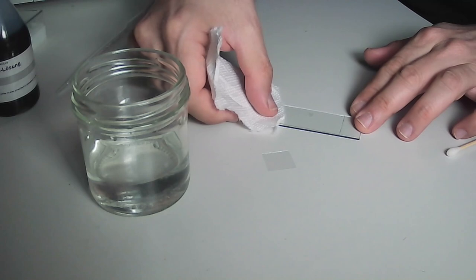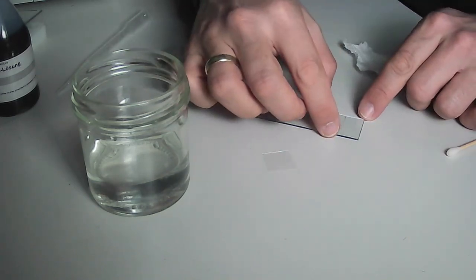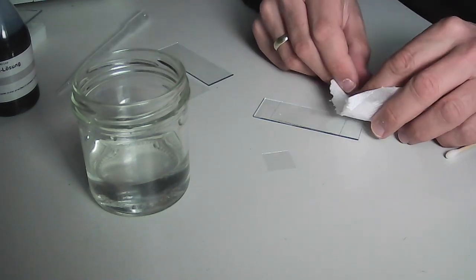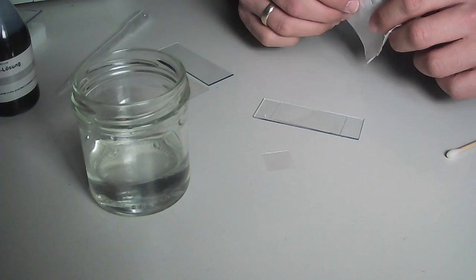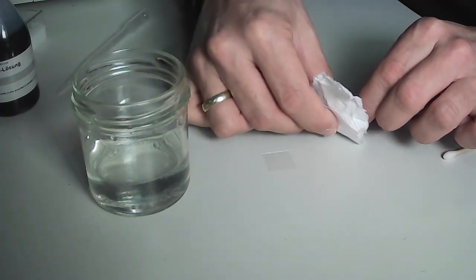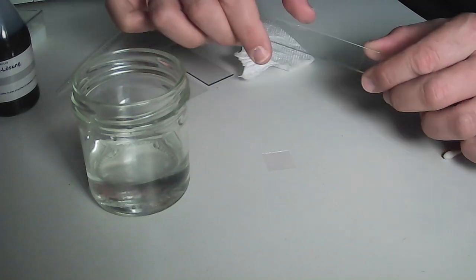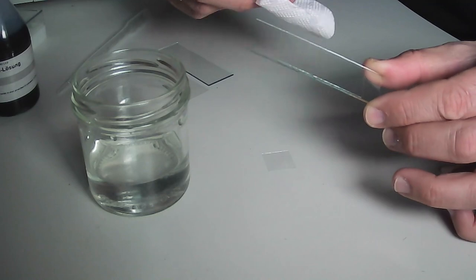Some people like to use filter paper. I do it the cheap way, because if there's too much water, then of course the objectives might become wet, and then you need to clean the objectives again. So, yeah. And also, because the cells are quite thin, because of the depth of field.